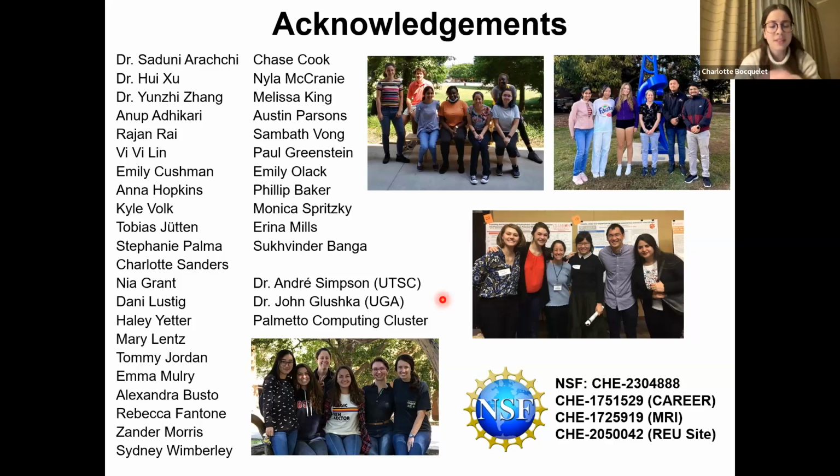And so with STD, you cannot access the strong affinities, right? So is it possible to hyperpolarize the ligand and then do a single scan T2 CPMG or a T1 measurement? Yeah, I know that Christian Hilty's group has been working on hyperpolarizing things, so that's definitely something that can be done. He compared his work to the STD NMR, but obviously the hyperpolarized work is going to give you much higher sensitivity.